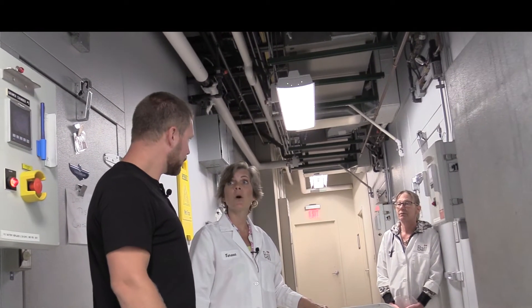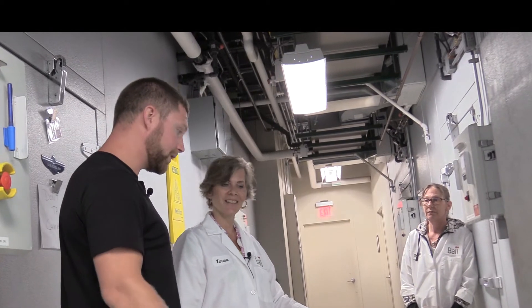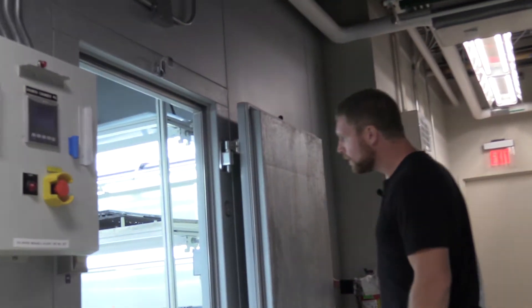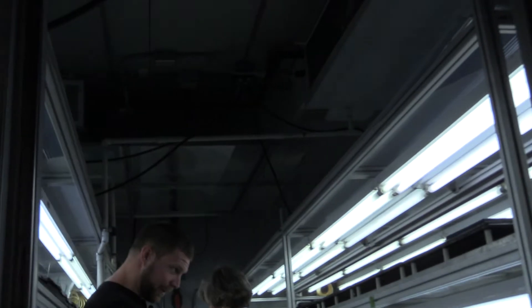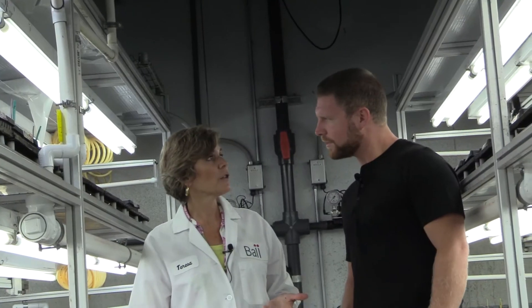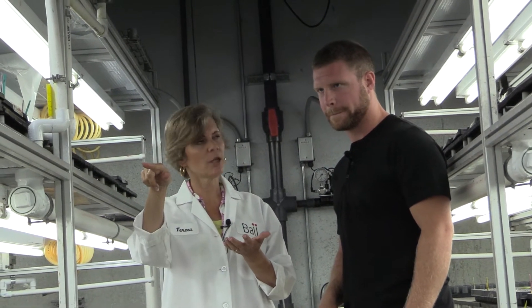Wow, definitely a lot more light in here! We call these our growth chambers, and this is where germination actually progresses. We go from early germination in the mist chamber to actual leaf expansion out here in the growth chambers.